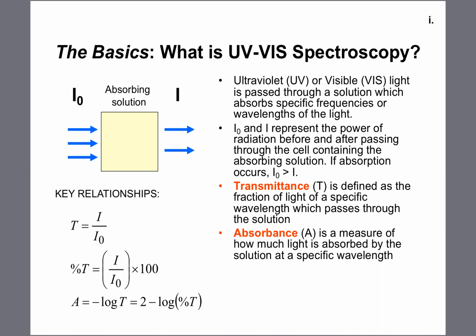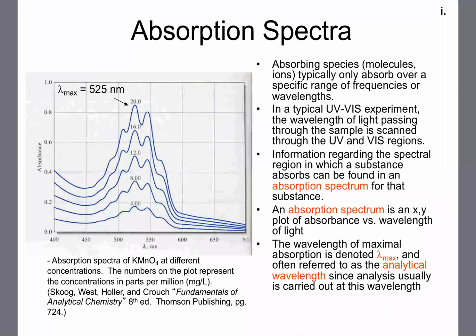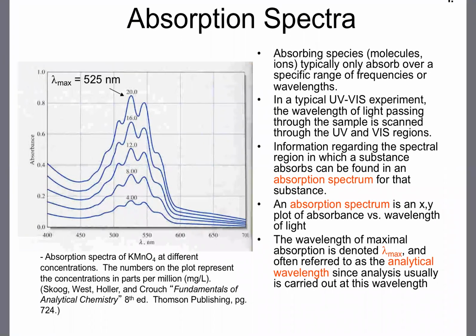But with a term now that is linearly proportional to analyte concentration, we're kind of off and running. So what can we do with this idea of measuring light transmitted through a sample? It turns out we can do many different things. Okay, let's look at this slide now.